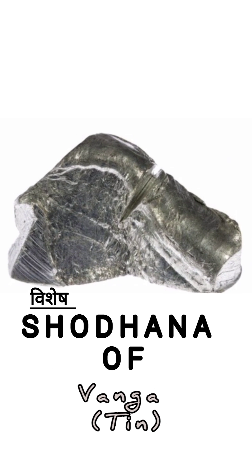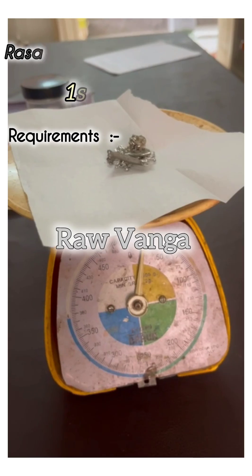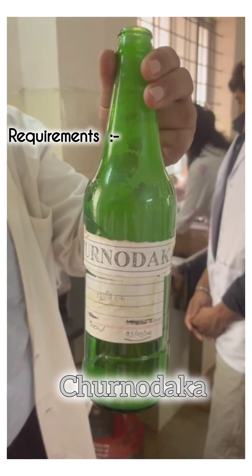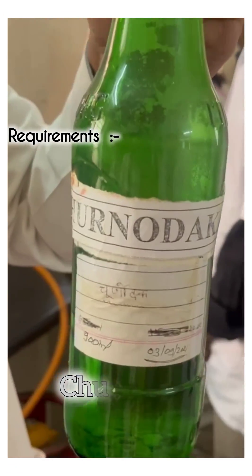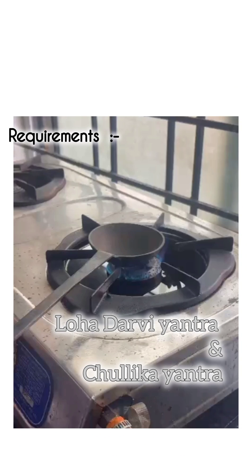Vanga. Purification of this Puthi Loha is discussed in this video. This requires raw vanga, churnodhaka, peetara yantra, chulika yantra, and a loha darvi yantra during the procedure.